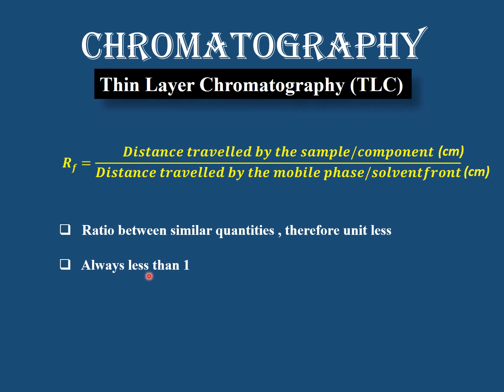So this is all about TLC, some of the basic things about thin layer chromatography. We might discuss the technique in more detail later on.